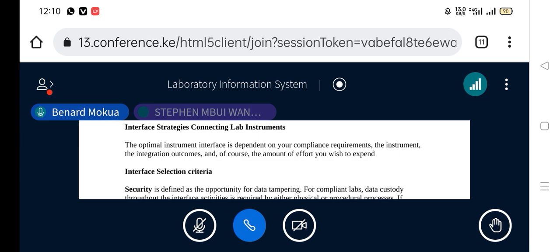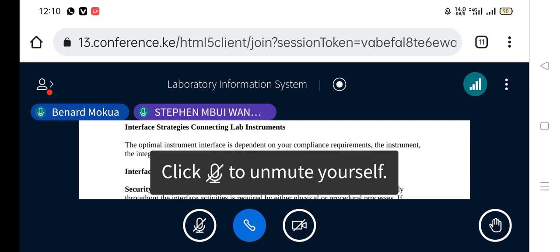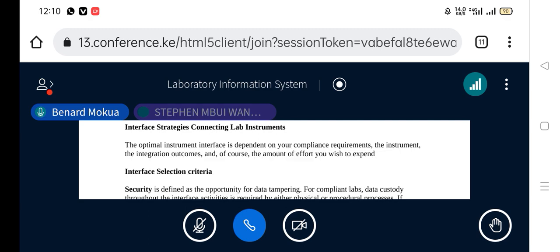And I think one of the most important things we also mentioned in this discussion is about our results. I want to talk about accuracy. It's about the results: accuracy, precision, and time.